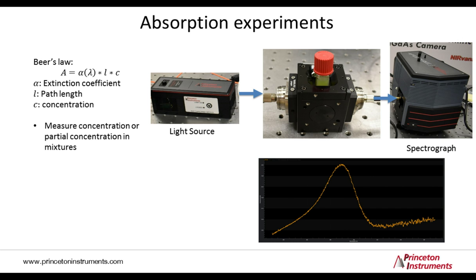The light passes through the solvent and is collected in another fiber that is connected to the spectrograph. The light is compared to a reference spectrum, like with only solvent or solvent with a sample in it, so that the system can directly output the absorbance, like how many percent of the light at a given wavelength are being absorbed.